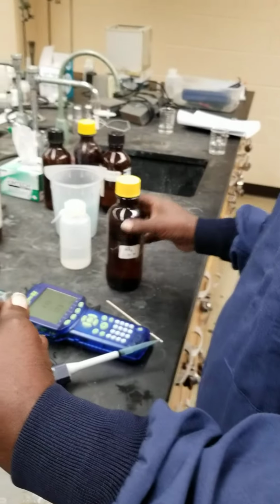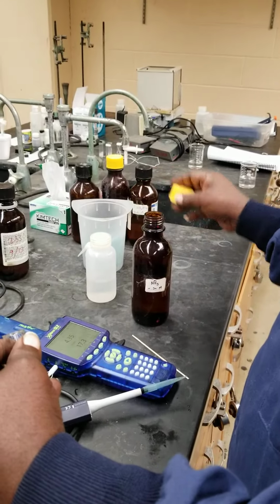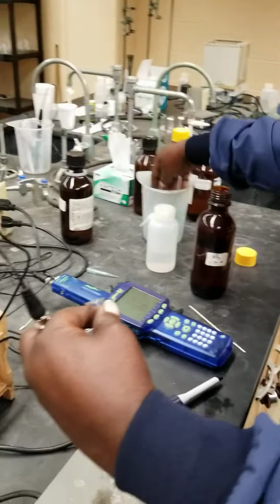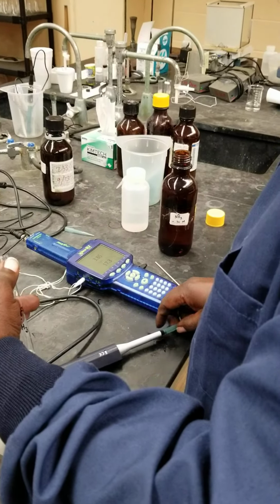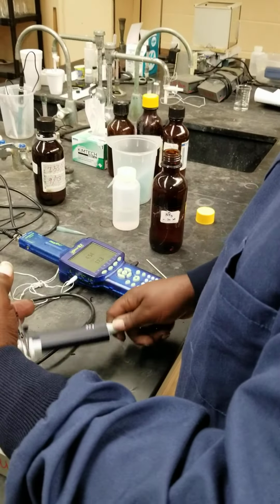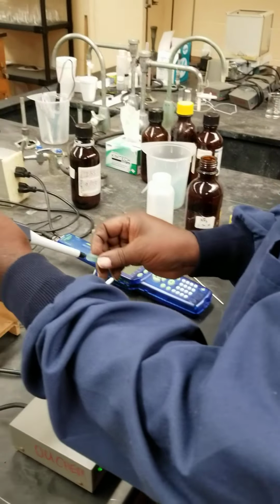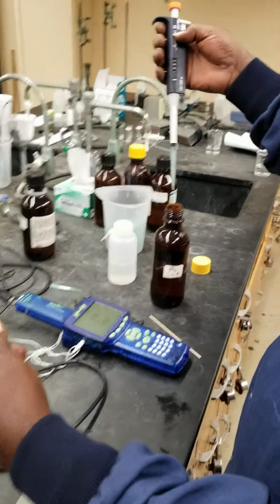Bring in the ammonia. Change the pipette tip. Always a good idea to avoid contamination issues. I only have 2 hands. All right, there we go.